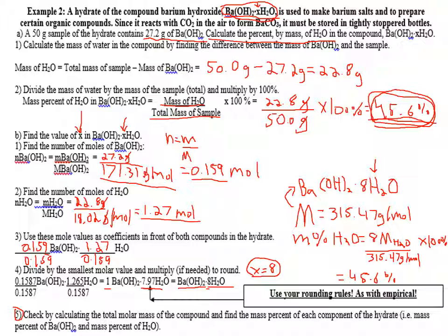Eventually, you'll get to a point where you keep on trying to heat it up, and you keep reweighing it, and the mass won't change much at all. When that happens, that means you got rid of all the water because nothing else is leaving. Even if you do have something that changes color, there might be some color left in between that you couldn't see. So it's always great to heat it up, weigh it, heat it up, weigh it again, until the mass stops changing.